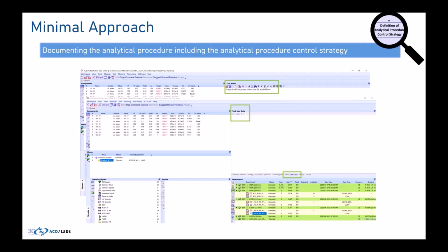The guidance states that all the steps should be described in sufficient detail for a skilled analyst to perform the analysis. So making sure that you have that detail there. In AutoChrom, the parameters that were used for the ideal method would be stored within the project, so you don't have to worry about recording that information. It's already there for you, and that can be exported into reports or it can be pushed into a database.